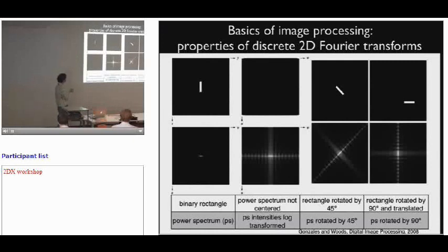Here the person has computed a Fourier transform. We don't see anything here, but this is not too worrisome because he just used a different convention in displaying this. If you see here, you see a dot in the upper corners, and this is sometimes what image processing software does. Because we only need half of the image to display, we can also start with the origin at the top. However, we are more used to, and you also, looking at diffraction patterns, so you would display the origin at the center of your image. This is what it looks like. It just looks like a strong intensity in the center. Doesn't really tell us much.